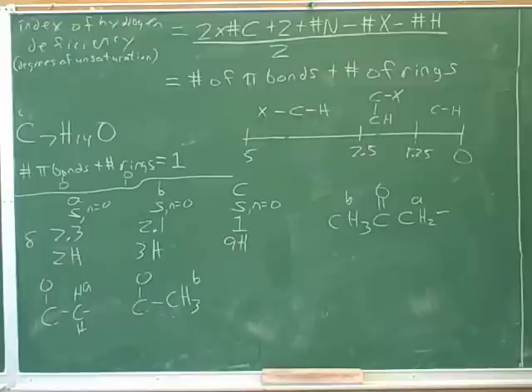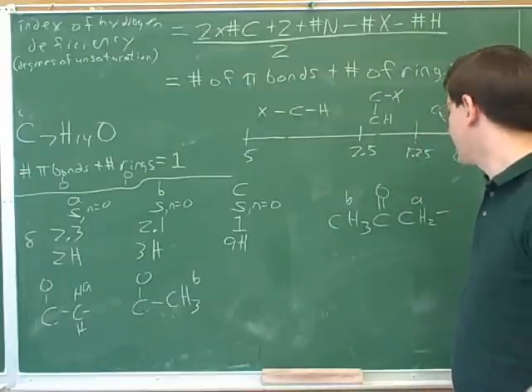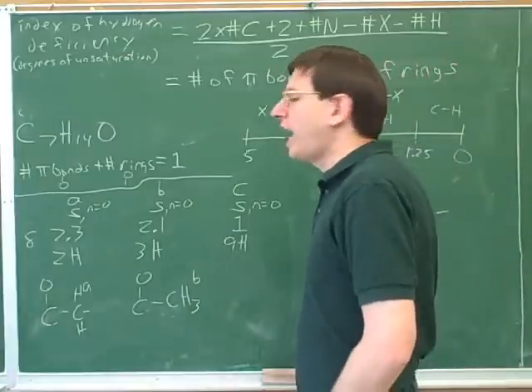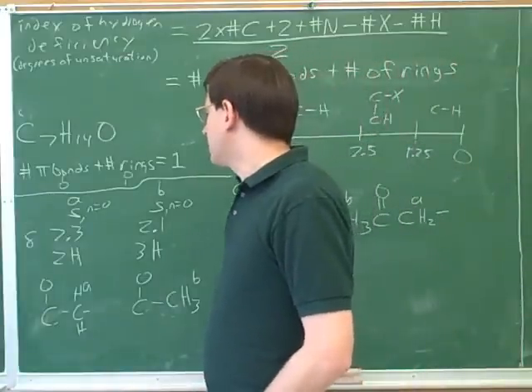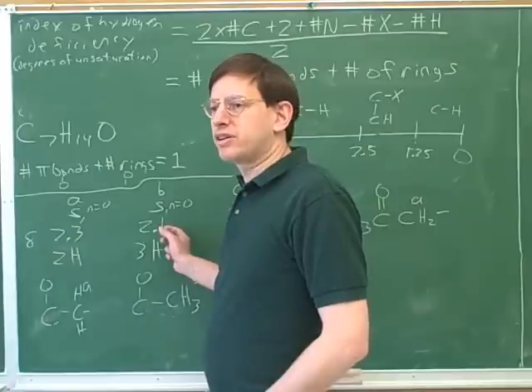But the double bond, that's right, because that would give this enough bonds. I guess we could put the double bond someplace else. However, as we were noticing earlier, this does not seem to be an alkene. Why does it not seem to be an alkene?